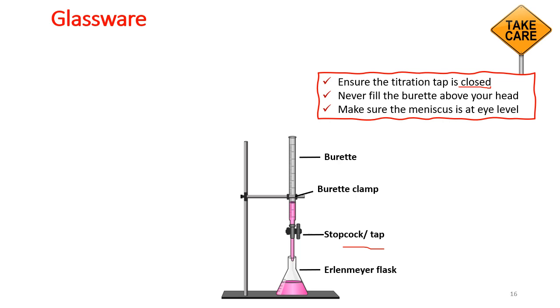Whenever you read a burette or you fill it, never keep it above your head. Always keep the meniscus that you're going to read at the same eye level, and even if you fill it, just keep it at your eye level, never higher or lower.